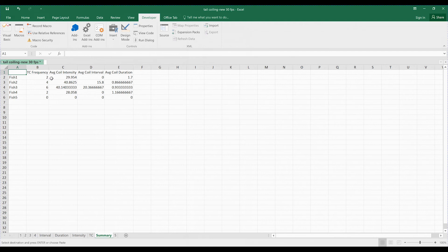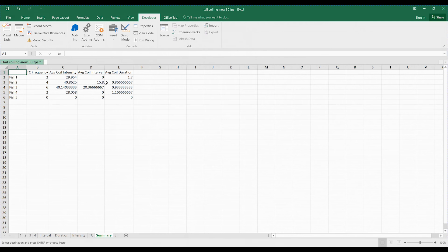If you only have one coiling activity, because the count is multiplied by two, there is only one particular event recorded, so the coil interval will be zero. If you want to be more precise, you should use a one-minute video for this analysis.